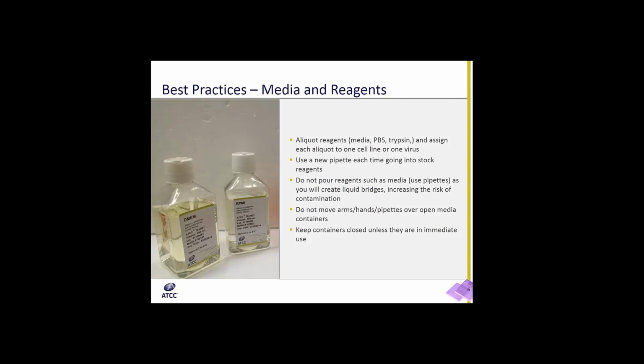A common route of contamination entry is by liquid bridge that forms when a droplet of culture media remains inside the culture vessel or its lid or on the neck of a culture medium bottle. So do not pour the reagents such as media, use pipettes. Do not move your arms, hands or pipettes over open media containers, and keep these containers closed until they are in immediate use.